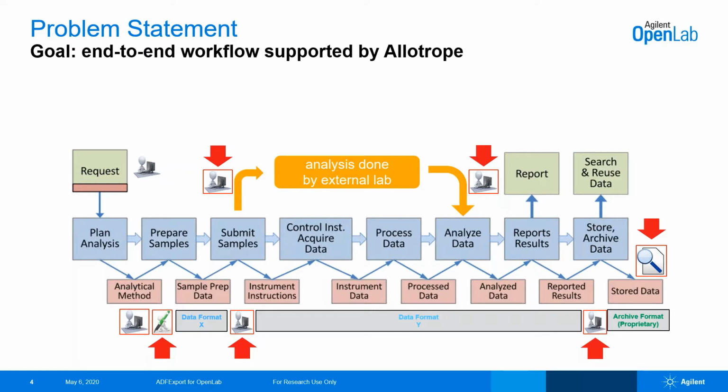So if you look at an ideal lab world, we could follow an end-to-end workflow, enriching data from unit operation to unit operation. You can see this in these blue boxes with the enrichment in the purple ones. And consolidating all information into one secure file for long-term archiving, for easy finding, and for reusing. And this is what we want to achieve with Allotrope. And for this, we have been engaged since 2014. The next, please.